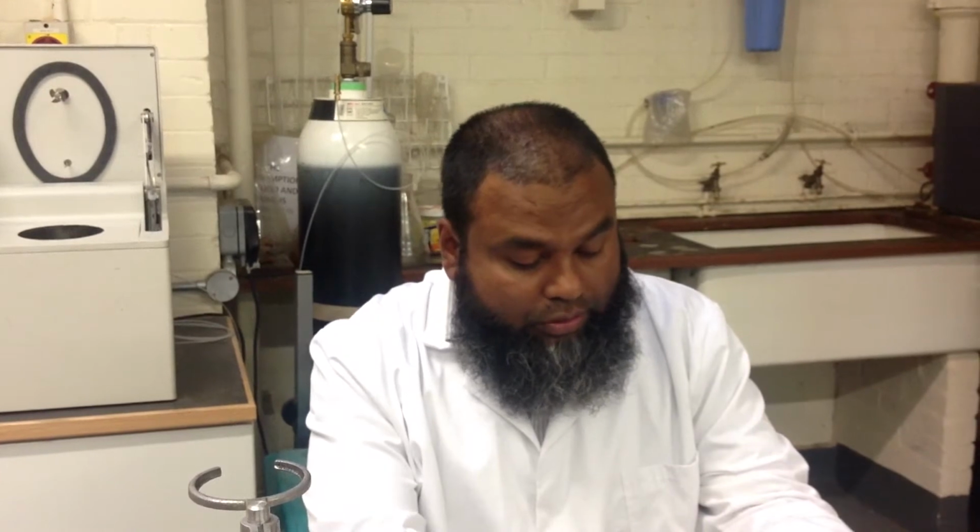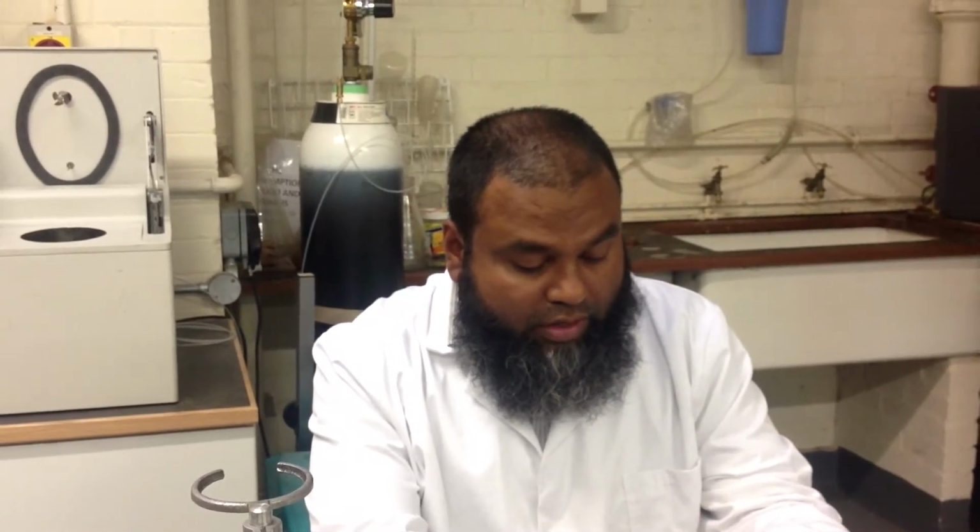If we know both, we can assess the performance, i.e. the efficiency of the machine. So the heating value or energy content of the fuel is a very important property. In this lab, you will be measuring the heating value of a liquid fuel and a solid fuel.